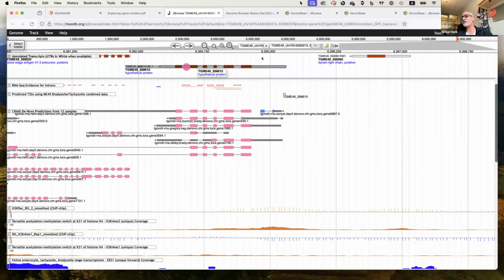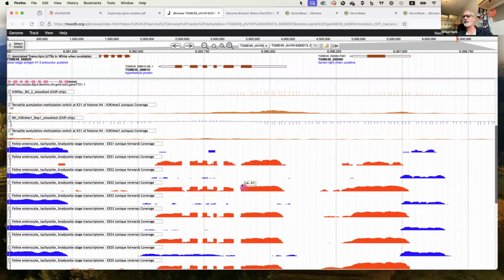And wherever you get a peak of binding, that tells you there's an exon. And wherever you get a trough or no binding, that tells you there's a possibility of an intron. And if we look at the raw data, here's some raw data of that. You'll see a big peak here. So there are a lot of reads binding here, so that tells you there's transcription going on here.